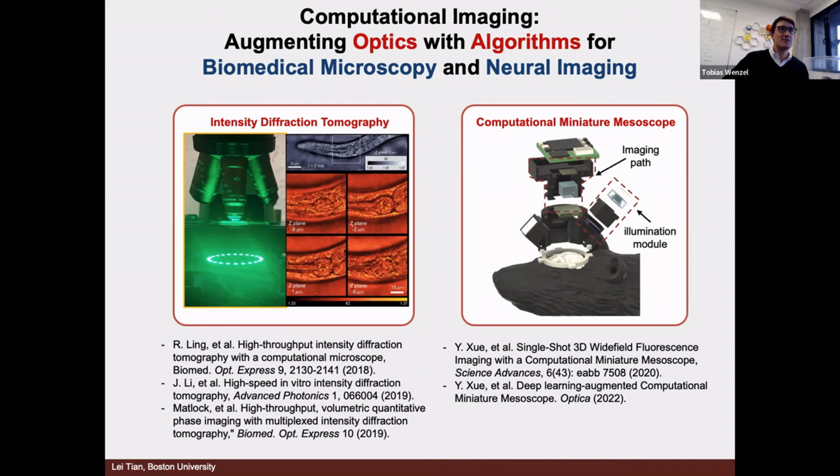And maybe you can also comment on the scale of the LED matrix that you need. You got really good results on the ring, which has very few LEDs, and that's really impressive. But a lot of people use just 8x8 LEDs, or even 5x5. We have a slightly bigger one than most, but yours is really large. So that's the second part of the question.